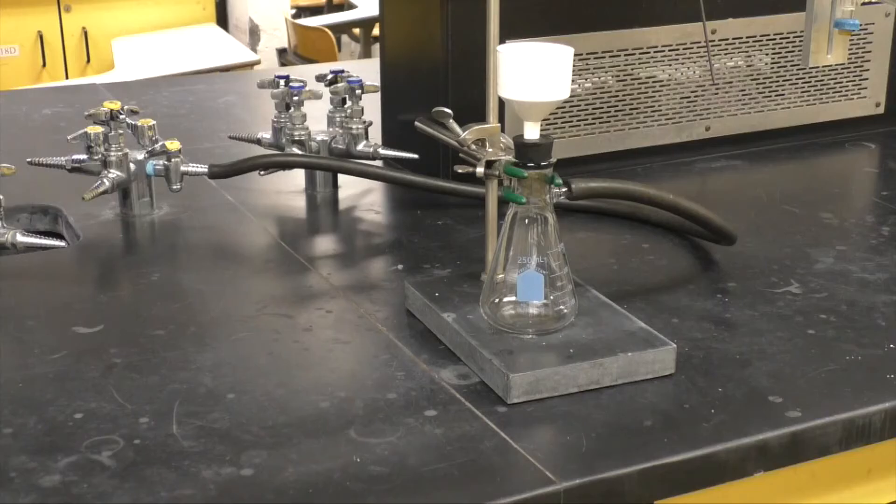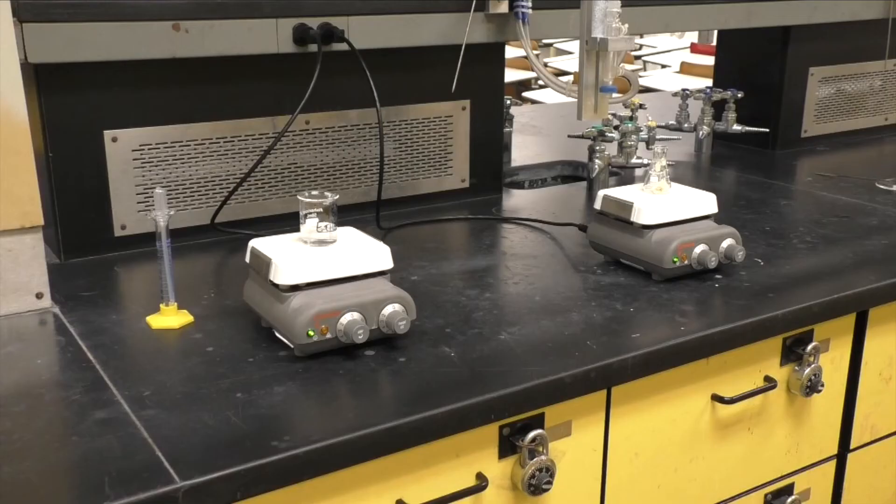Clean a Buchner funnel, rinse with acetone and let it dry. Set up a suction filtration apparatus and gather two clean 25 milliliter Erlenmeyer flasks, a stir bar, and two hot plate stirrers.